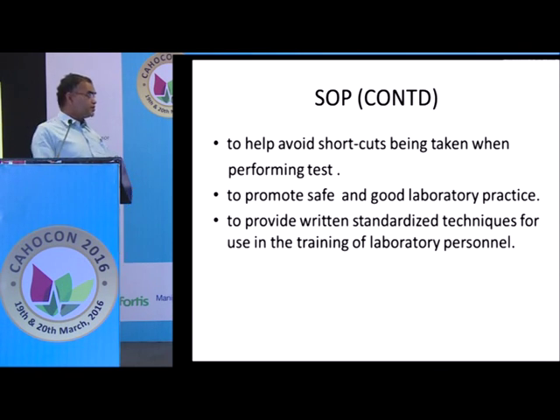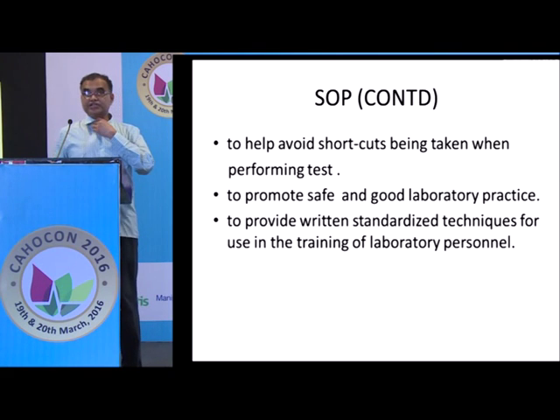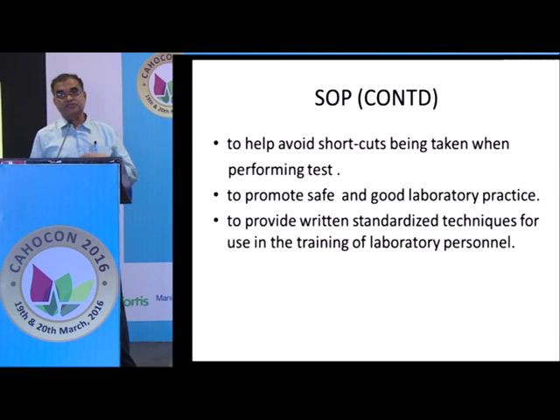Now, promote safe and good laboratory practice, and definitely, provide standardized techniques for use in the training of laboratory personnel, because in an institution where you have a lot of newer recruits or newer technologists being trained, you will require some kind of guideline. So if you can adhere to this, this will definitely help make our life easy and smooth.